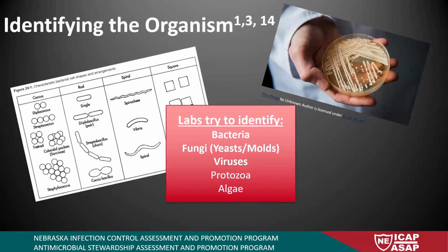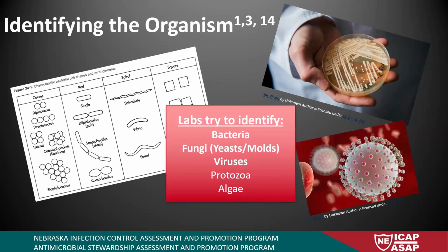Dr. Iwan, what is this one? Do you know? By looking at it, can you tell what that is that's growing on the plate? Is that a staph? Cool. See, we got Dr. Iwan in here. He's going to tell us. Or a virus or something like that. They're trying to find different things. You're not going to find a virus on a plate, but there are just different pictures of what we're trying to identify.